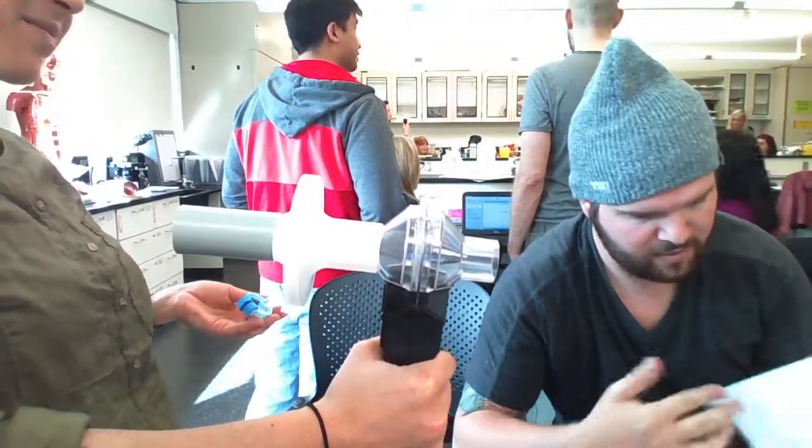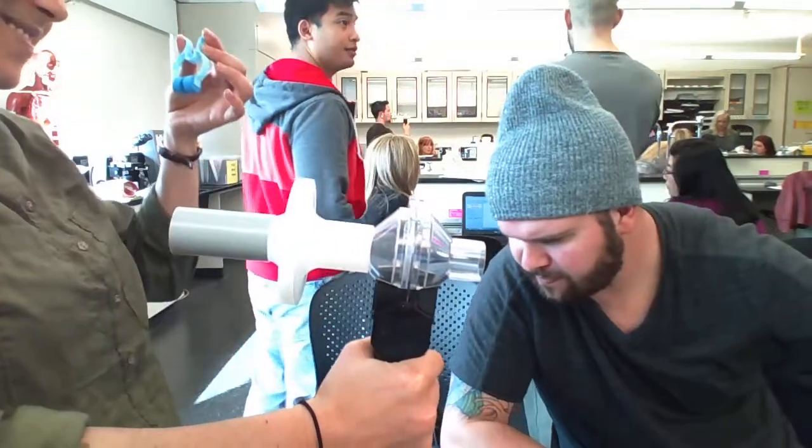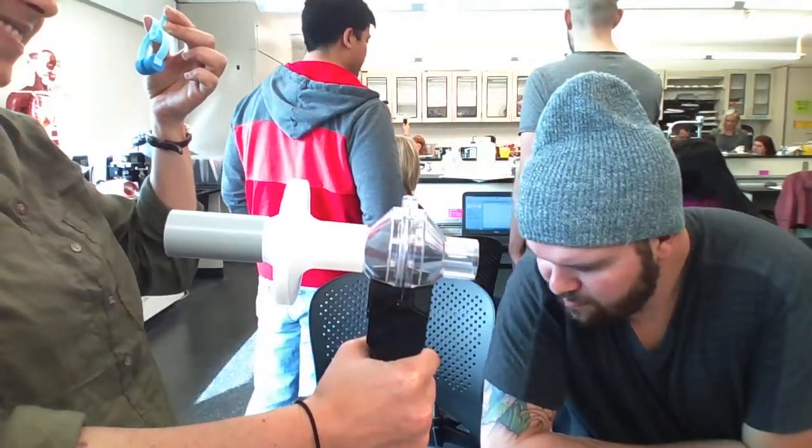Put on your nose clip prior to data collection. Take several breaths for 20 to 30 seconds.